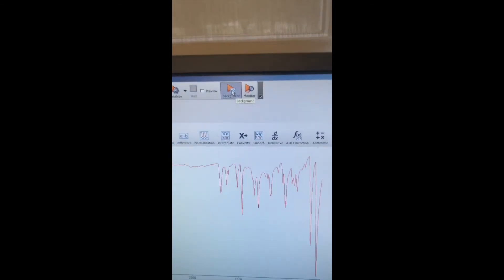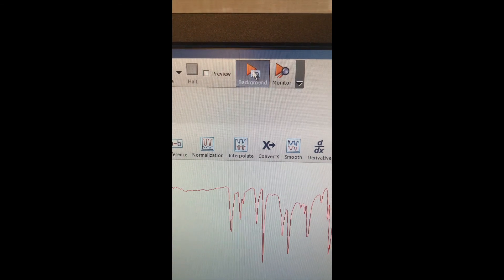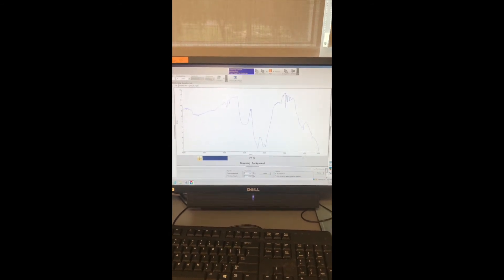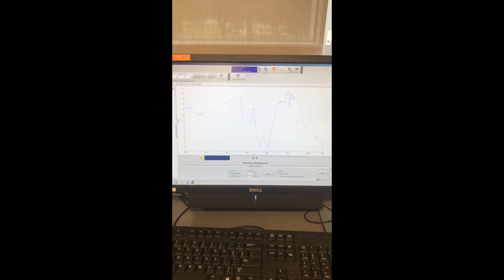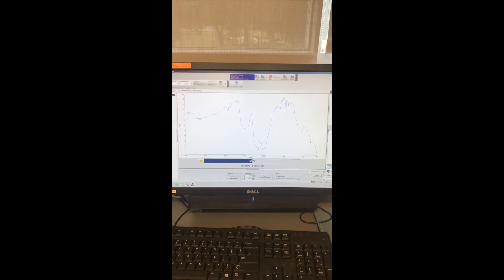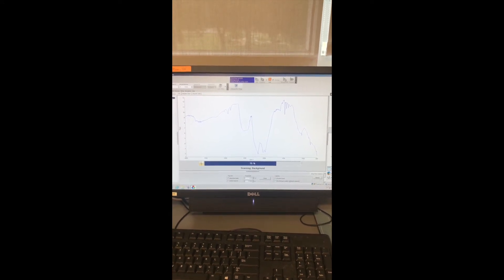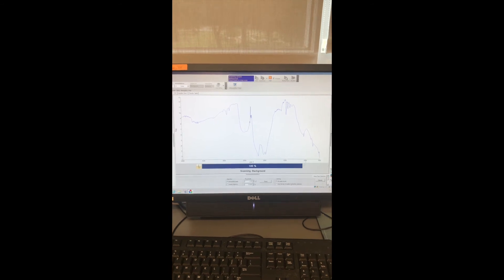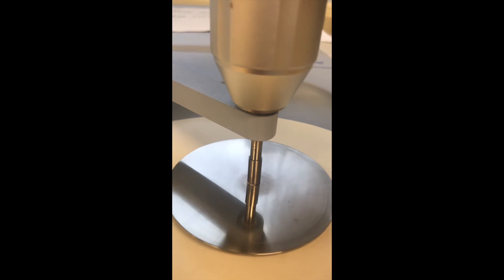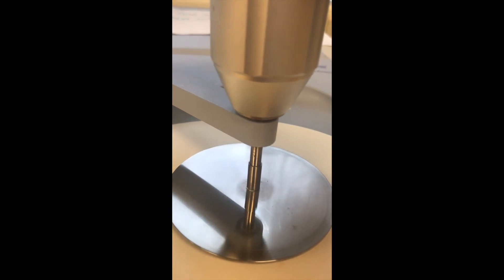A little more insight into how to get an IR spectrum. The first thing you're going to do is hit the background scan button. It takes about a minute, and you'll see the spectrum that shows up on the screen here is going to be the background scan. We'll wait until the bar at the bottom gets to 100%, and then that means we're complete, and we're ready to go ahead and run our sample. We load our sample onto the sample chamber and turn the knob to finger-tighten that apparatus.